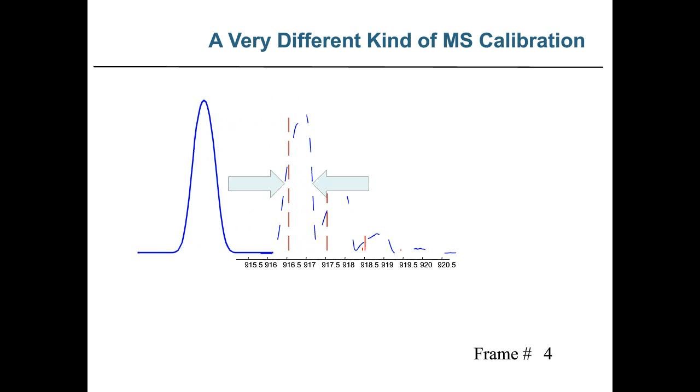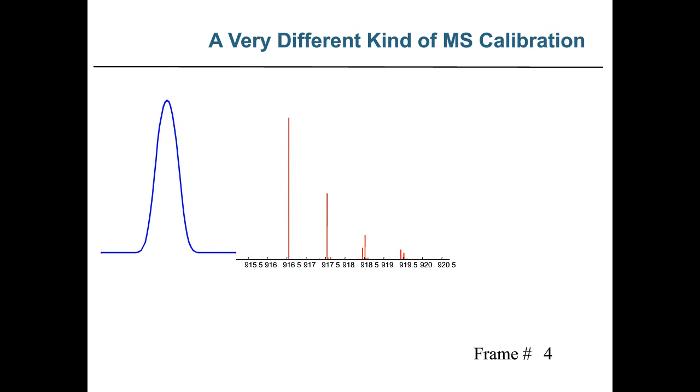The next step is since we know what the standard is, we can calculate a theoretical mass spec, which has infinite resolution, and you can see all the isotope peaks and all the isobars. And the beauty of mass spectrometry, unlike almost any other analytical technique, is we can very accurately calculate the spectrum because we know the masses of all the elements, and we also know the isotope distribution for the most part in nature. So this makes mass spectrometry very unique. We can actually calculate any mass spectrum.